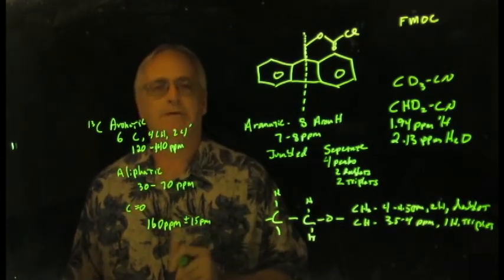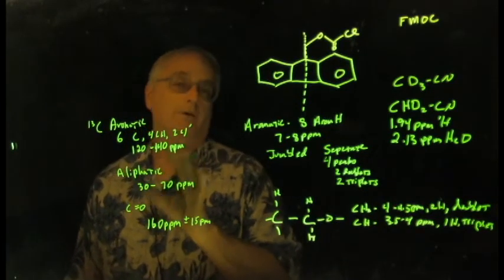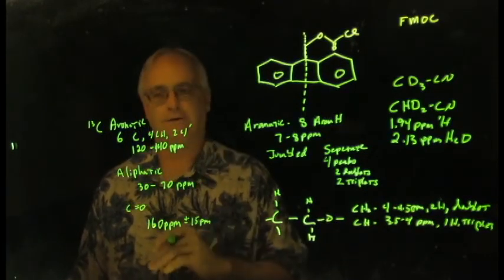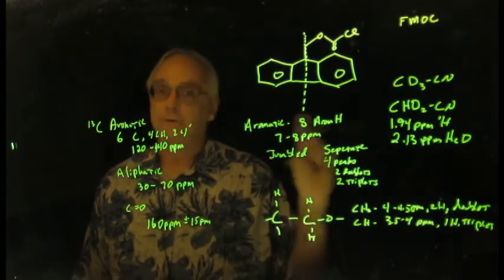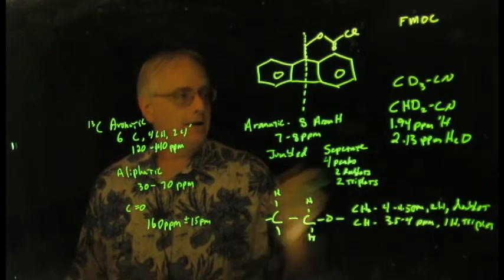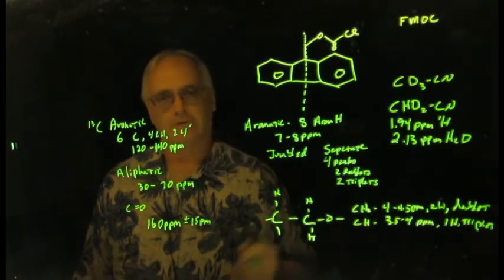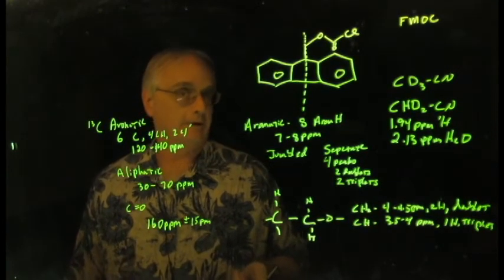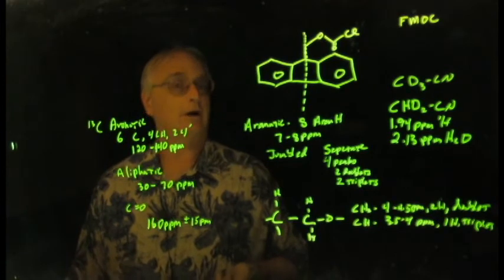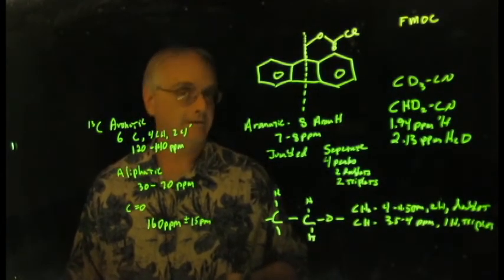Now, before we dive into the carbon spectrum, I do have to do one other thing. Probably should have done it before I started talking about the C13, but, you know, what the hell. And that is residual solvent peaks again. There's a trace of the hydrogen in there, but in deuterated acetonitrile, as we talked about, almost every single solvent we use outside of D2O is going to have carbons in it. These positions are about 1% C13. We're going to see them.